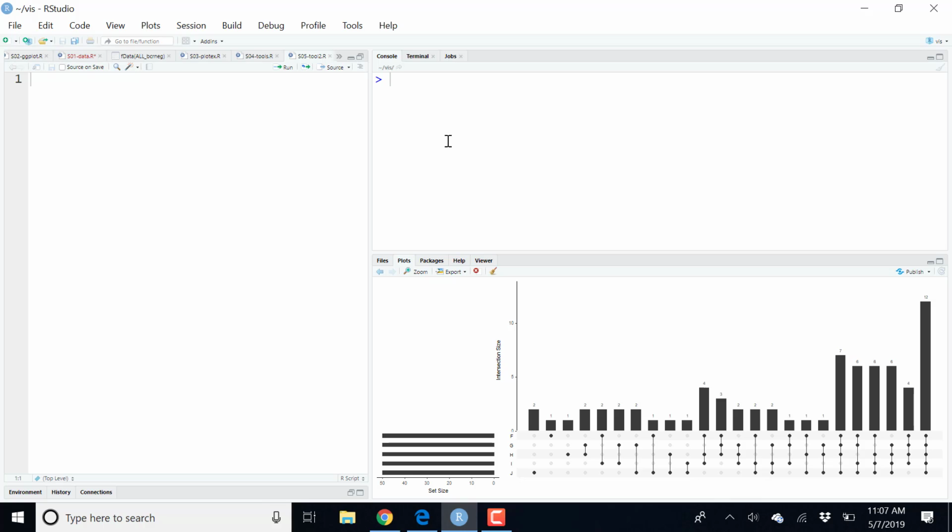And typically the way this is visualized is using a tree-like structure, a dendrogram, where the leaves are all individual samples, and then we start to combine them based on this clustering result. Okay, and then we had 1, 2, and eventually grouping all the samples together.